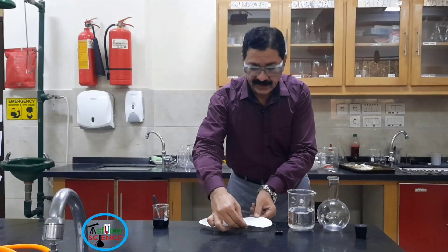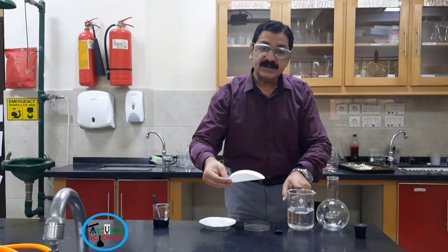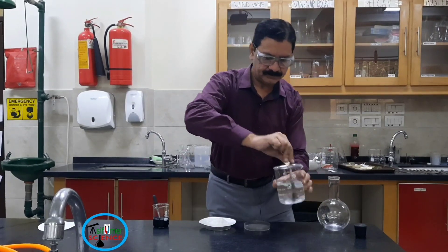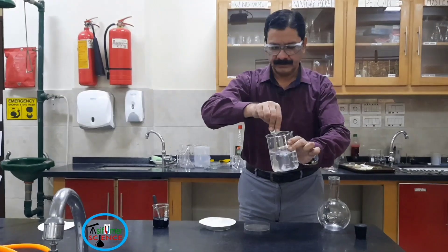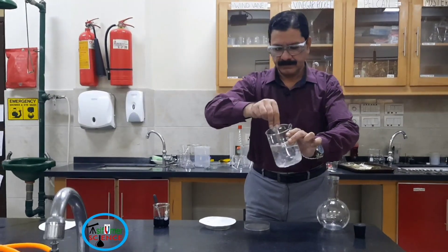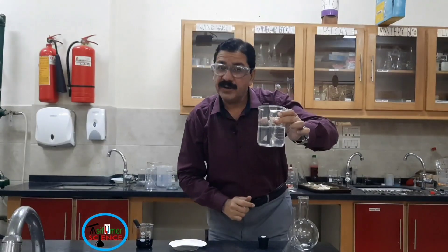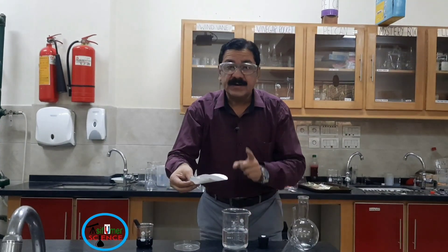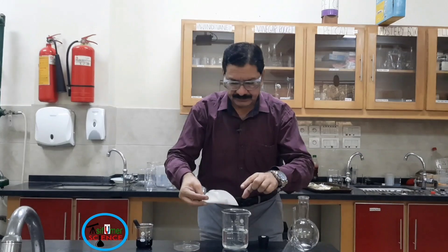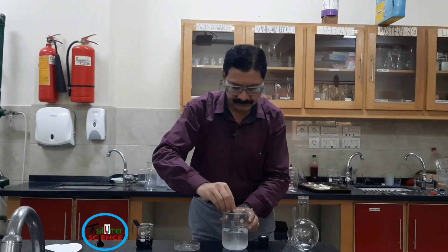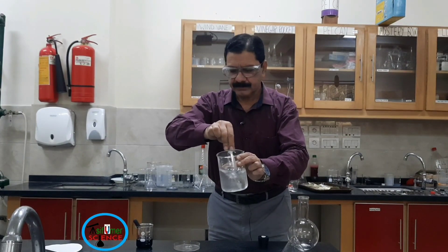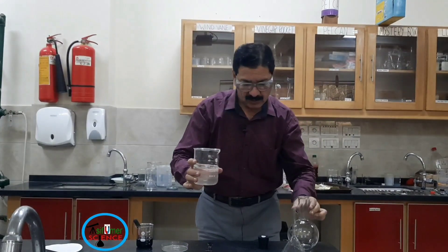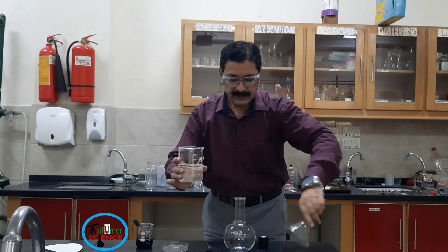Now I am going to add 8 grams of sodium hydroxide in 300 ml of water. Sodium hydroxide completely dissolves in the water. Now I am going to add 10 grams of glucose in the same solution. Glucose also dissolves in the solution.